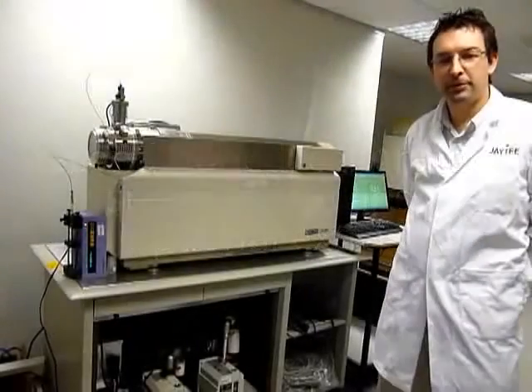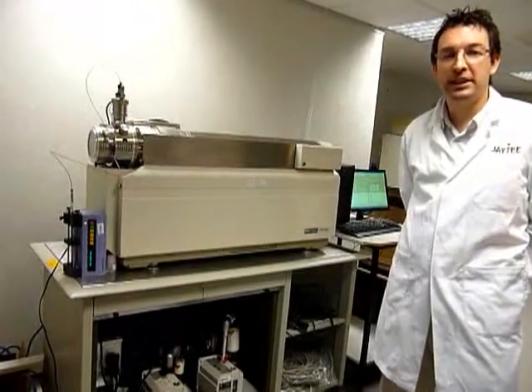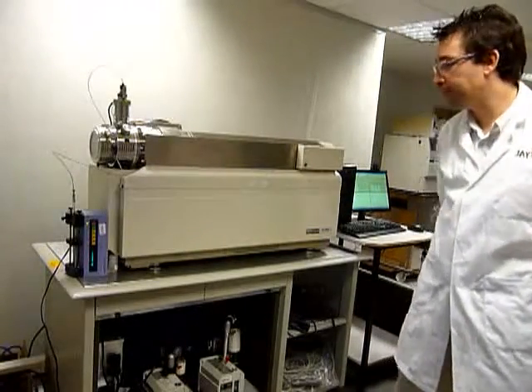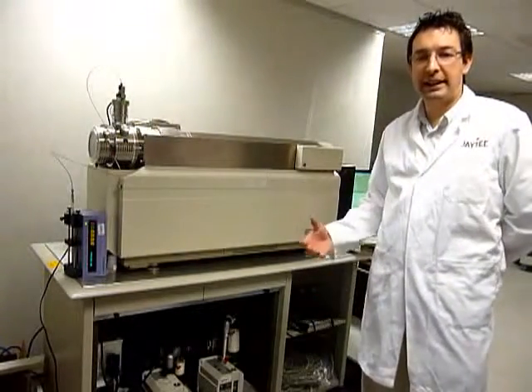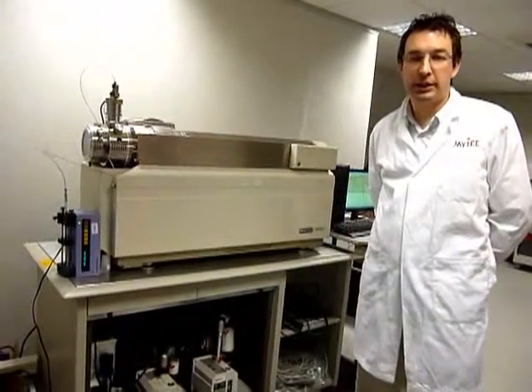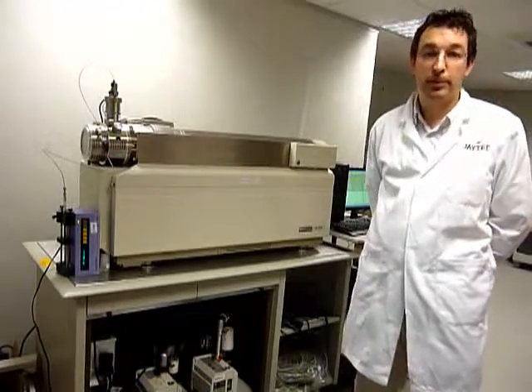If you purchase an instrument from JT Biasanters, you can be confident the instrument will be fully refurbished to factory specifications. This involves cleaning, changing consumables, and calibrating and tuning out to specifications.